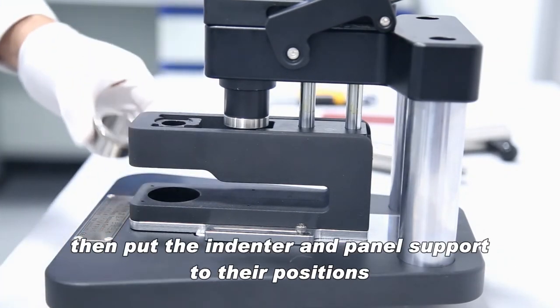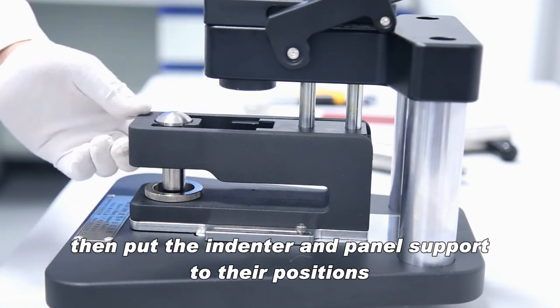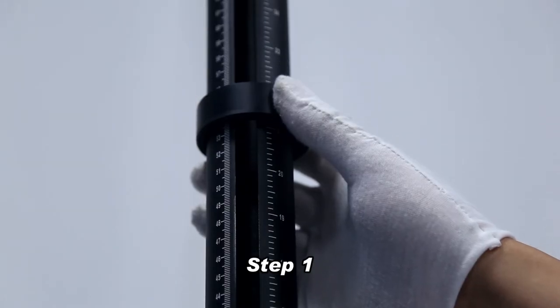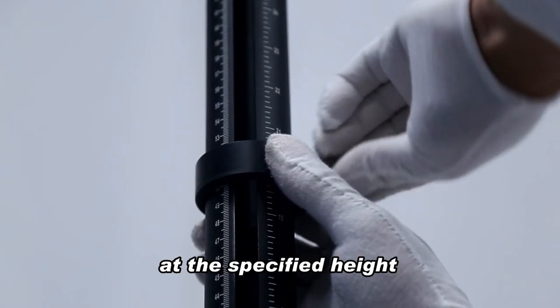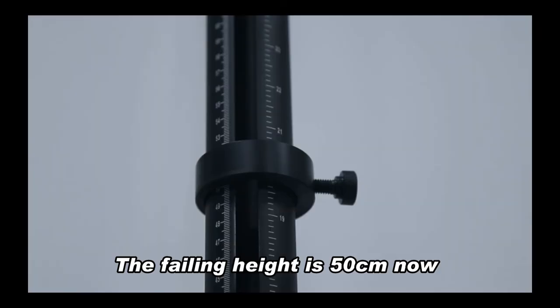Then put the indenter and panel support to their position. Adjust the height limit ring to make its lower edge align at the specified height. The falling height is 50 centimeters now.